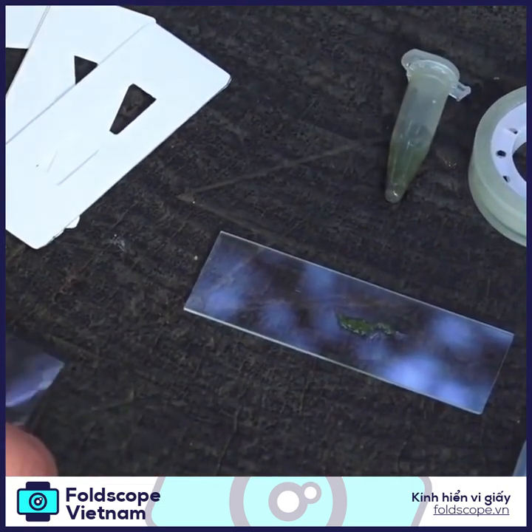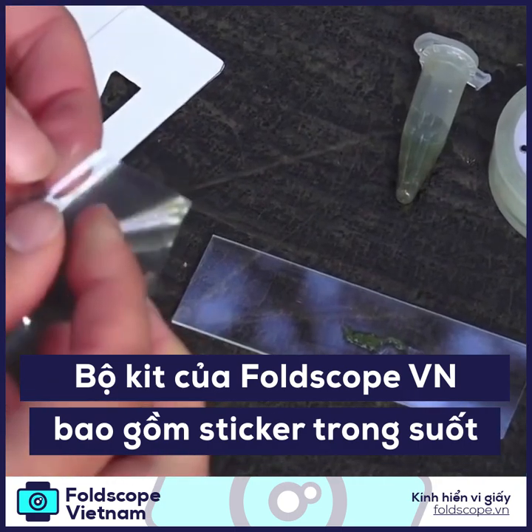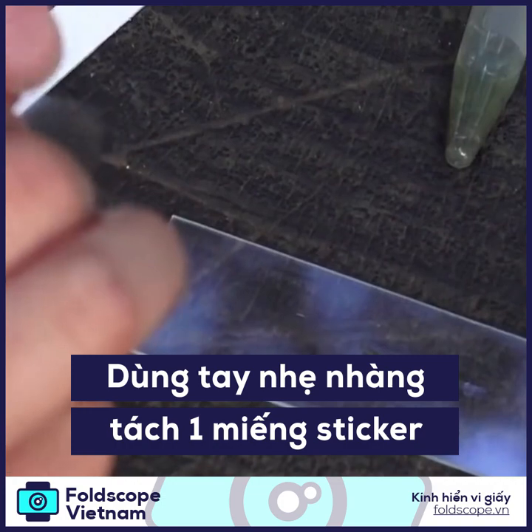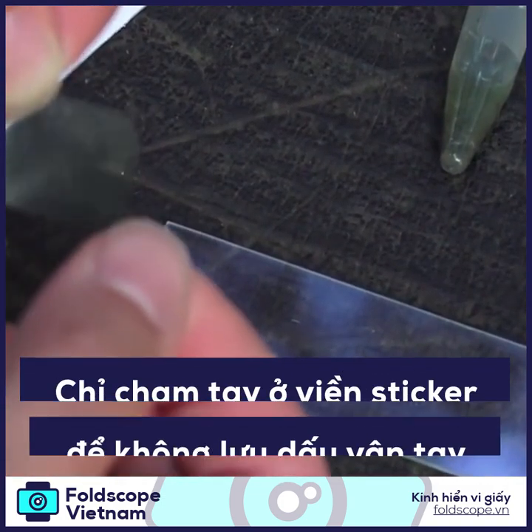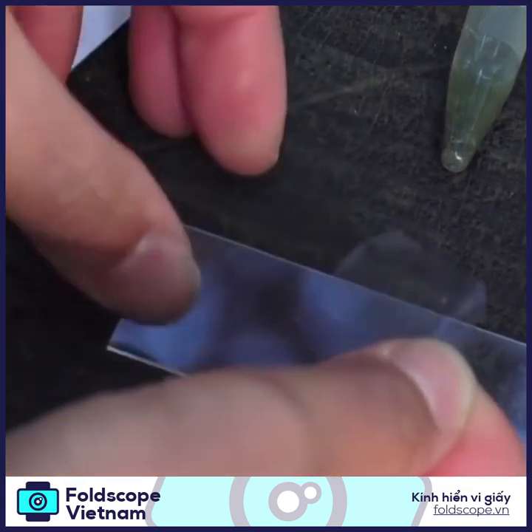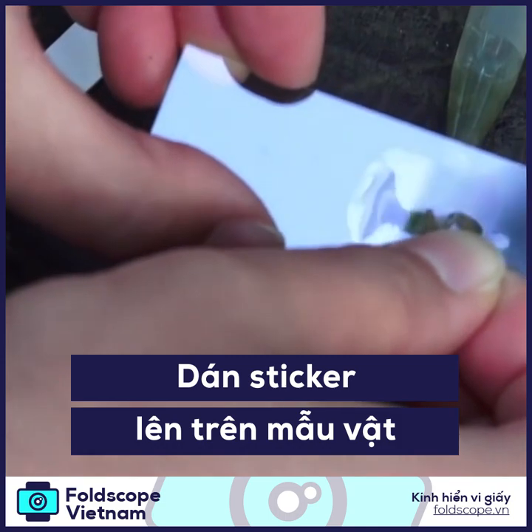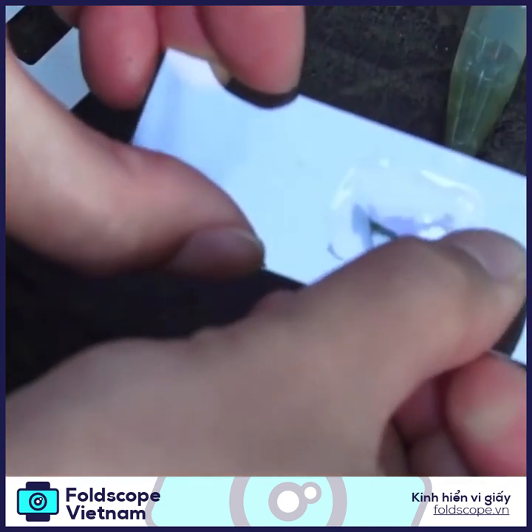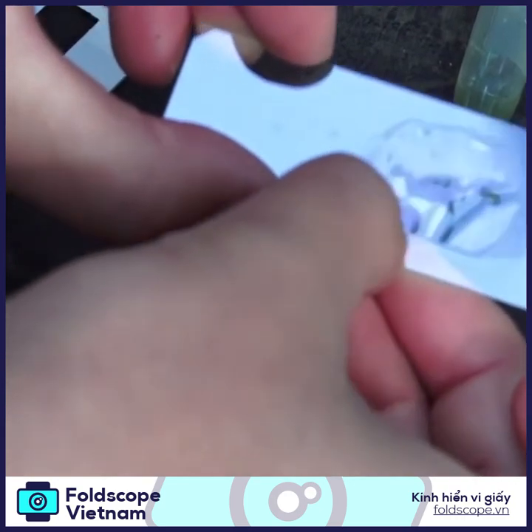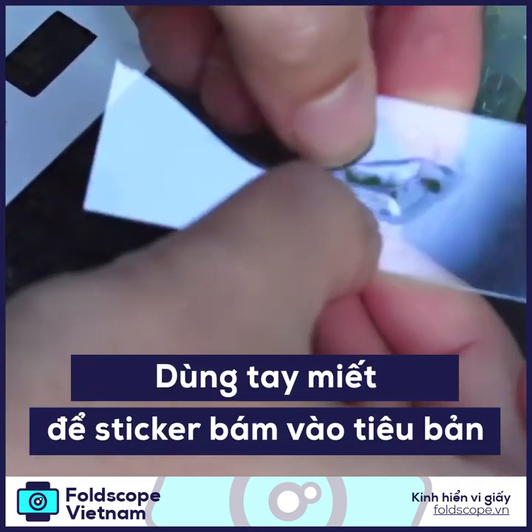The kit comes with cover slip stickers. Just take one of these and make sure you're holding the edges so that you don't leave your fingerprints right in the middle, and place it right on top of your specimen like so. It should stick pretty firmly.